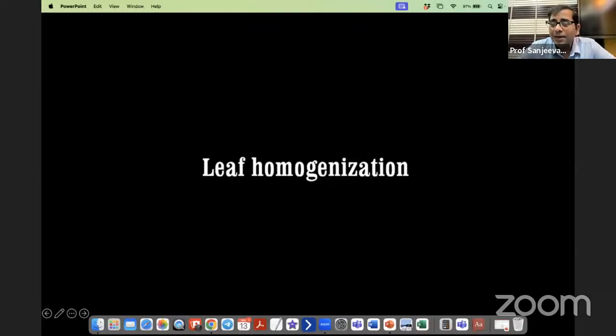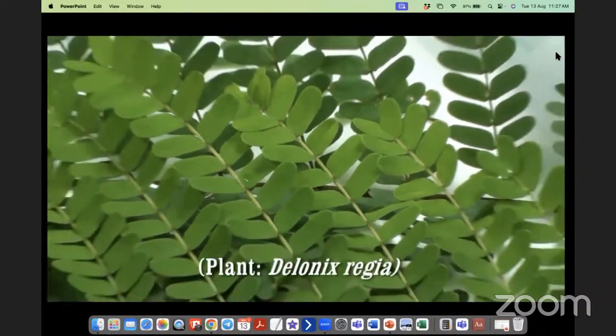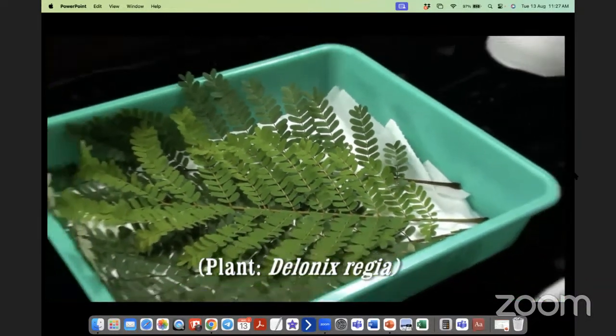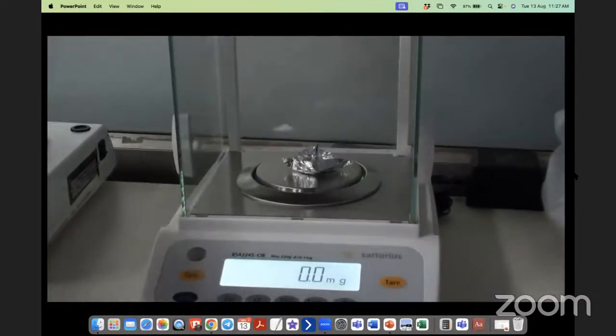We can show you a lot, but I think some students are interested in plant proteomics. So let me show you this clip of plant sample preparation. Select the plant leaf sample of interest and weigh around 300 mg of the leaf on an aluminium foil.